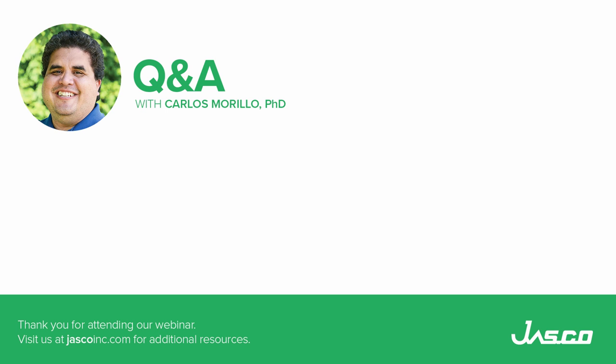In other of these seminars, can you demonstrate the use of the instrument with a demo macro with a liquid sample? I think so. This is the first Raman demo, and I just covered very few things, so I think that we can visit again the Raman combined with FTIR. I think that would be a great idea.